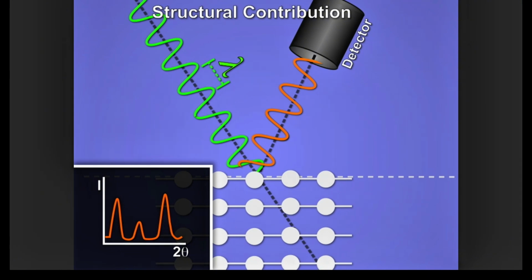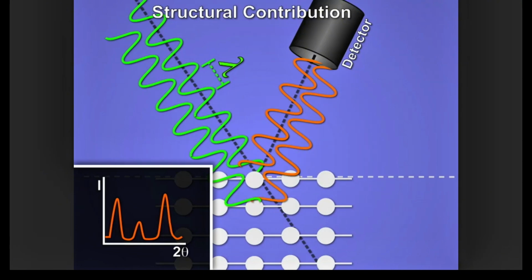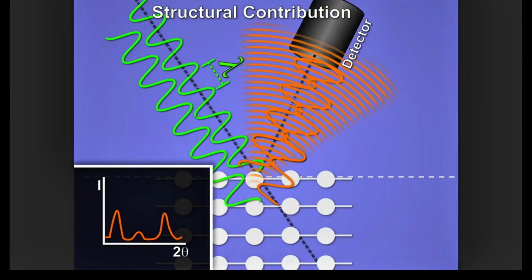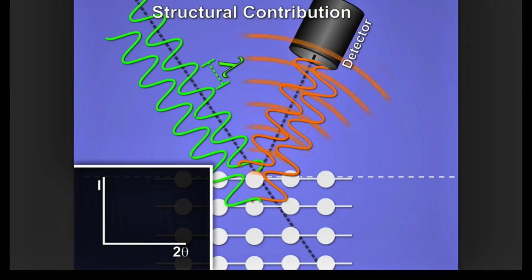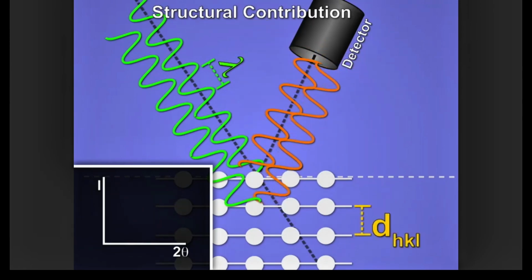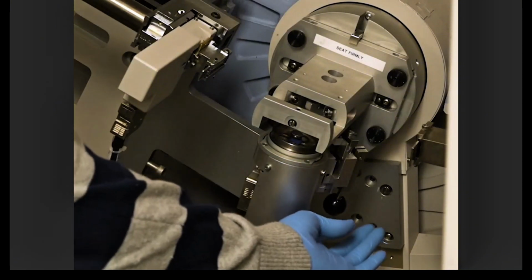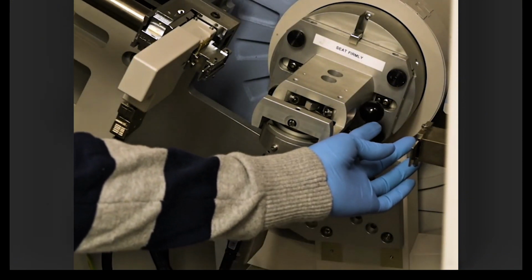Each diffraction peak is in fact the sum of all the scattered amplitudes from multiple ray paths diffracted by all the unique atoms in a unit cell. If scattered lights are in phase, there is constructive interference, while if they are out of phase, there is destructive interference. These interferences directly affect the amplitude of the XRD peaks, representing the hkl planes of the crystal. We will now see how these principles apply in an actual X-ray diffraction experiment.